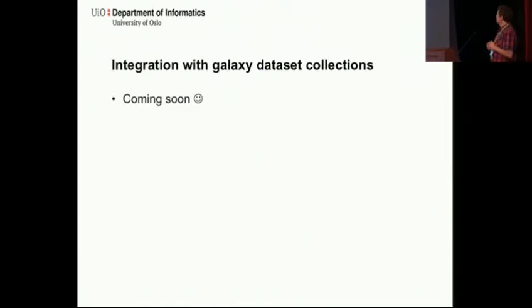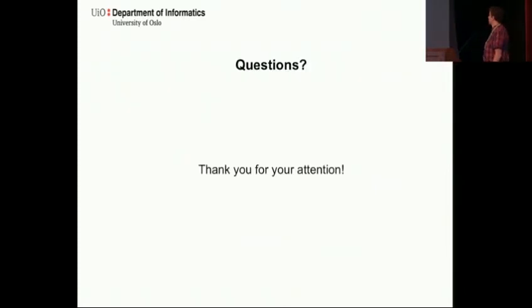Of course, integrating with Galaxy dataset collections is something we are planning. We were planning it for a long time, but one thing that we were missing from Galaxy dataset collections is the metadata, which is quite useful in statistical analysis. So that's something we will try to figure out later. I think that's about all to say. If you have any questions.